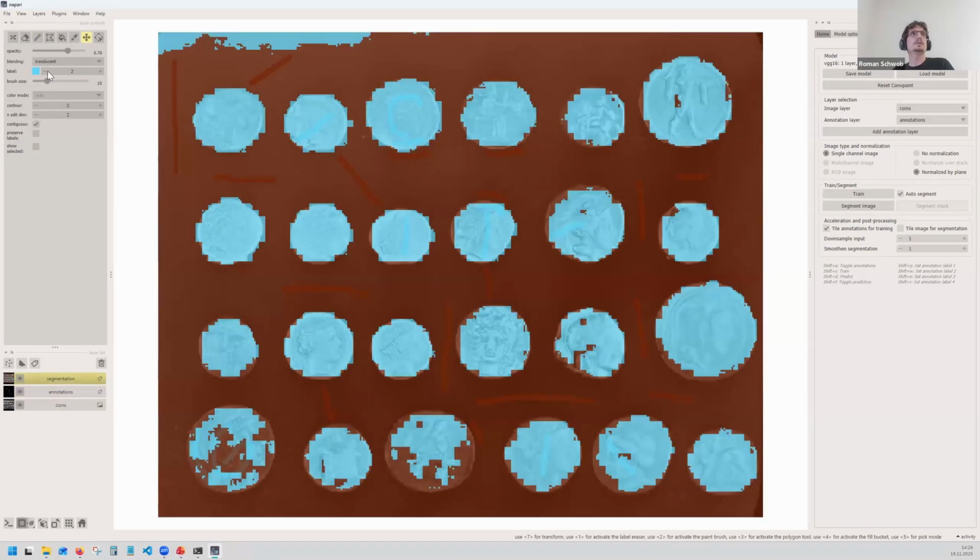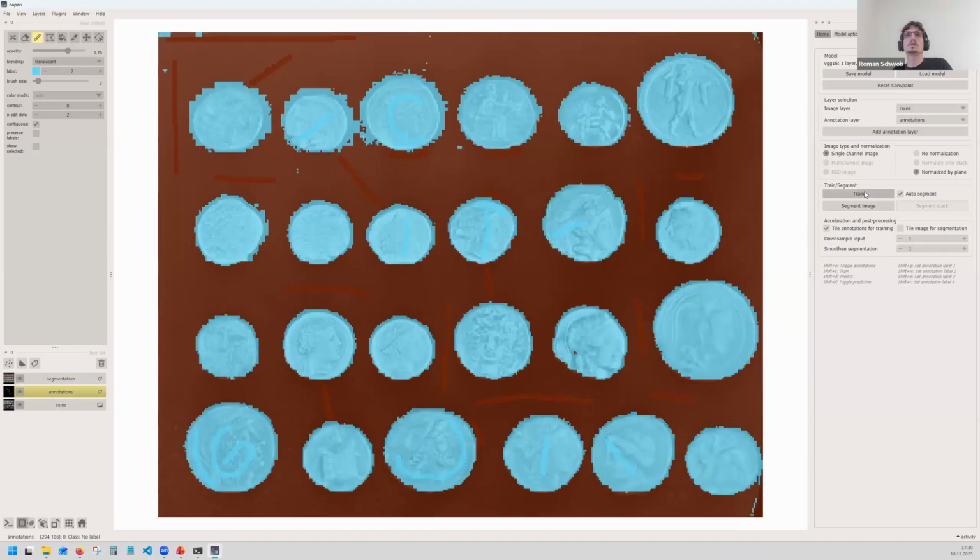And this up here, we really want to be, again, go to annotation, this. And let's actually maybe add something here as well. And let's just give it another try, because we can always go back and adjust it again.